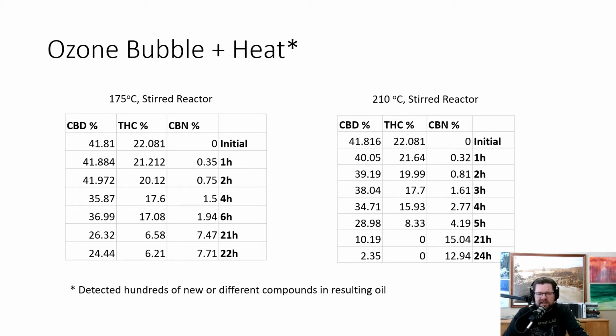We found out that the timing is about the same. If you're starting off with, say, 6, you're still degrading quite a bit of the CBD down, half, and it doesn't really matter. It still takes a long time, and you still have the same amount of degradation of your CBD, and you also are creating CBN.